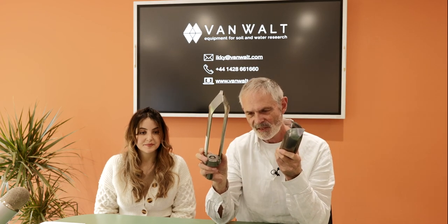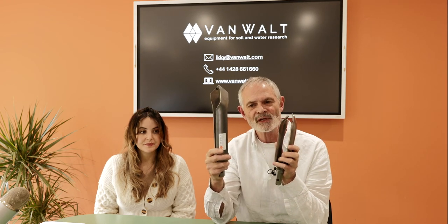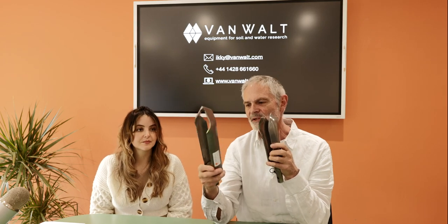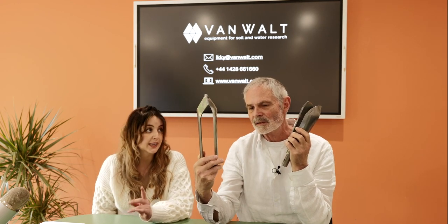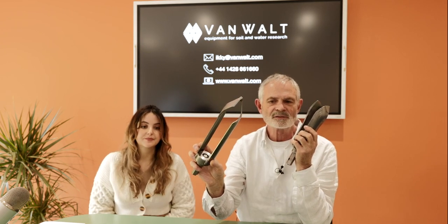So first onto the simple hand augers. There are many different types, and there are different types because you have to cope with different types of sediment. So in my right hand is an open-faced auger, 64mm diameter, very good for clays. Very good for clays, aren't they? Nice and open, so very easy to empty.